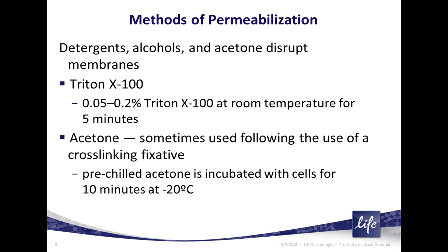Sometimes people will do an acetone permeabilization. Acetone delipidizes quite strongly. This can be a problem for some proteins, especially membrane proteins. Doing the acetone protocol, you would use it pre-chilled at minus 20 degrees and exposed to the acetone only for about 10 minutes.